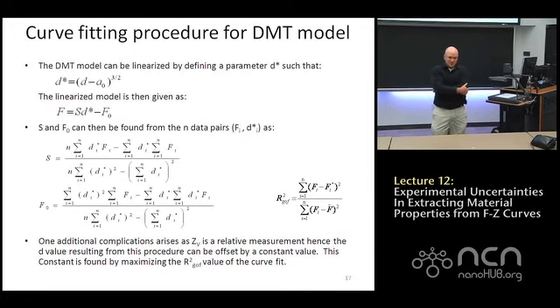So ultimately, Z is arbitrary. D is arbitrary to a model. If you have a model, that will determine where your 0 in D is. So you need to choose Z such that your 0 in your model is the best 0. Well, how do you get to the best 0? You can look at the curve and try to pick a point, but that's slightly arbitrary.